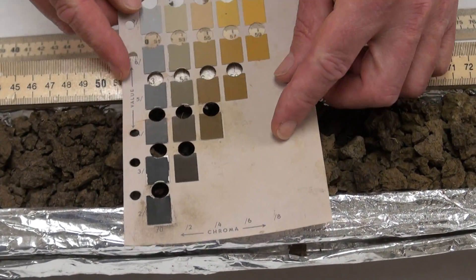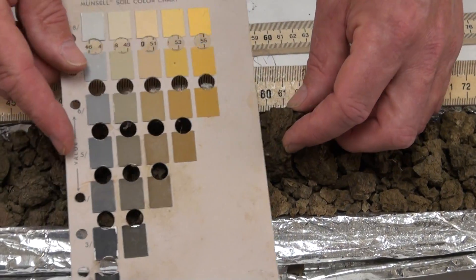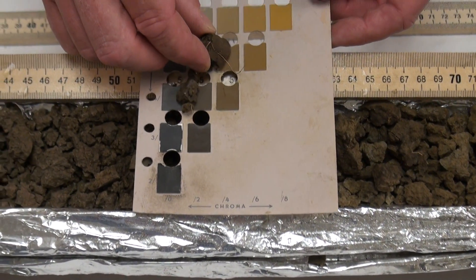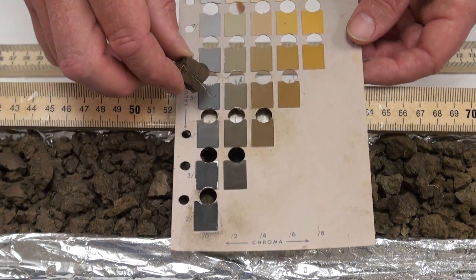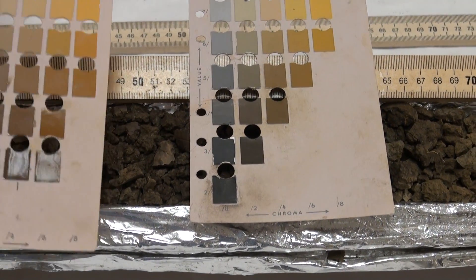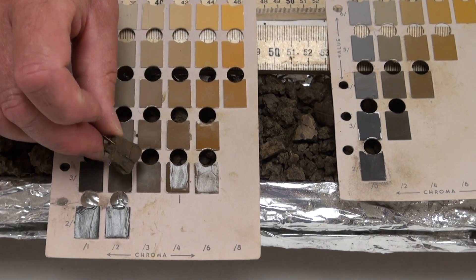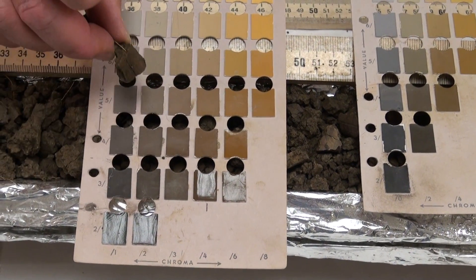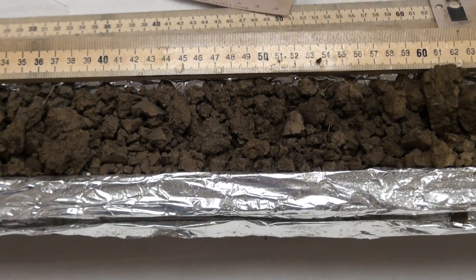Rarely does the hue change, but the value and chroma could — especially the value. I don't think it looks as good as it did before when it was dry. Let's try it with the yellow red page. I think this is a little closer to a 10 YR, value 3, chroma 3. Very close match there. So, 10 YR 3 and 3 at around 50 centimeters for a moist color. I'll write that on my data page.